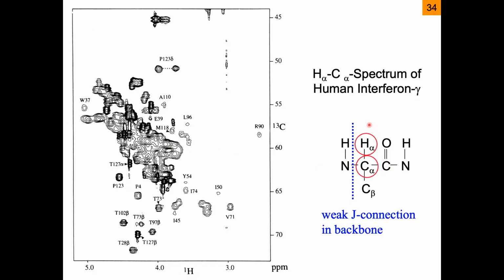And in a way, there is kind of a dividing line between the nitrogen and the C alpha because of the recoupling and the strong relaxation, that once you have passed this, your experiments lose a lot of sensitivity. And so doing these assignments, because of this overlap, you want to connect via the C alpha, but you're never quite sure whether this is the right connection or the wrong connection. And so it's very ambiguous.